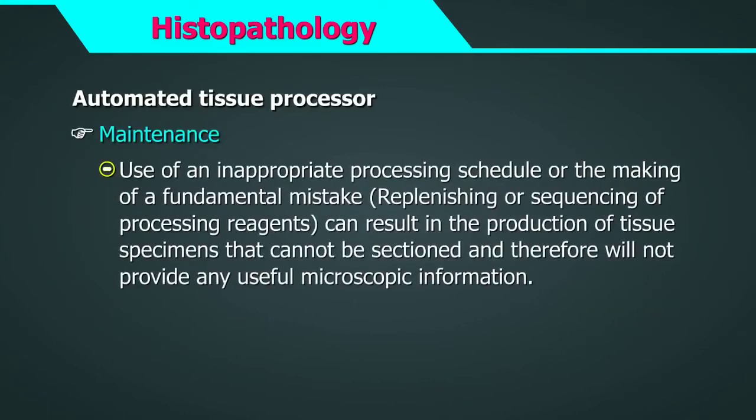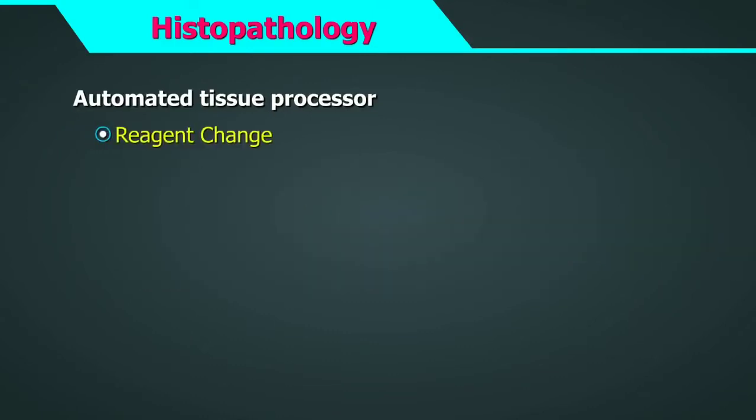Maintenance. Use of an inappropriate processing schedule, or the making of a fundamental mistake, perhaps in replenishing or sequencing of processing reagents, can result in the production of tissue specimens that cannot be sectioned and therefore will not provide any useful microscopic information. Reagent change.